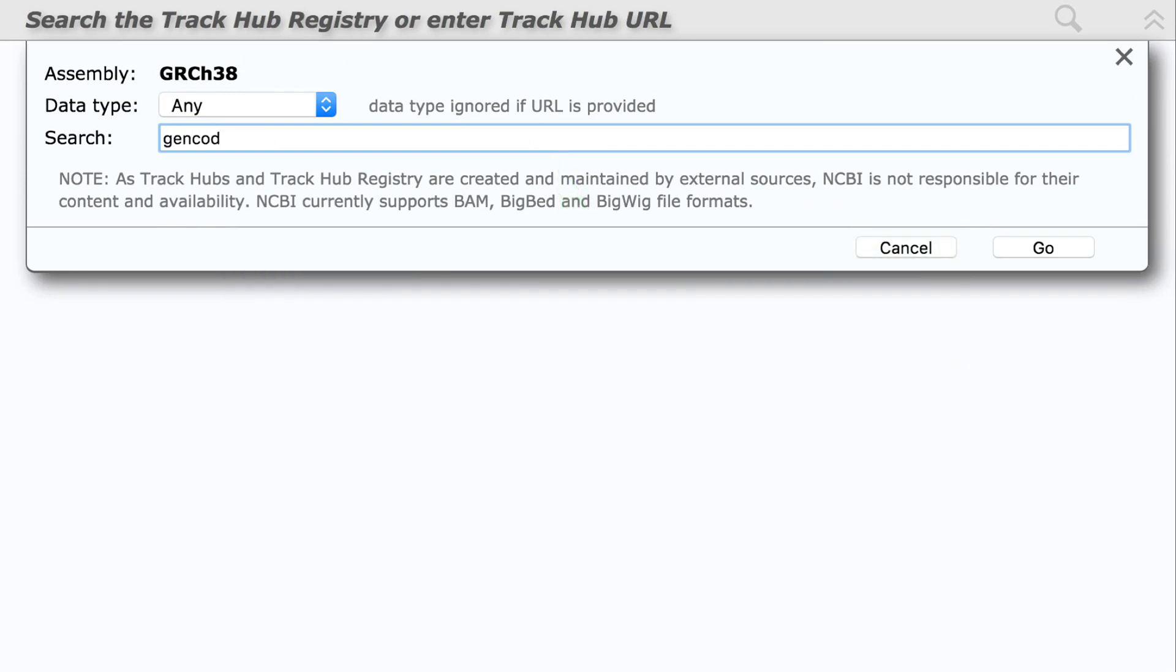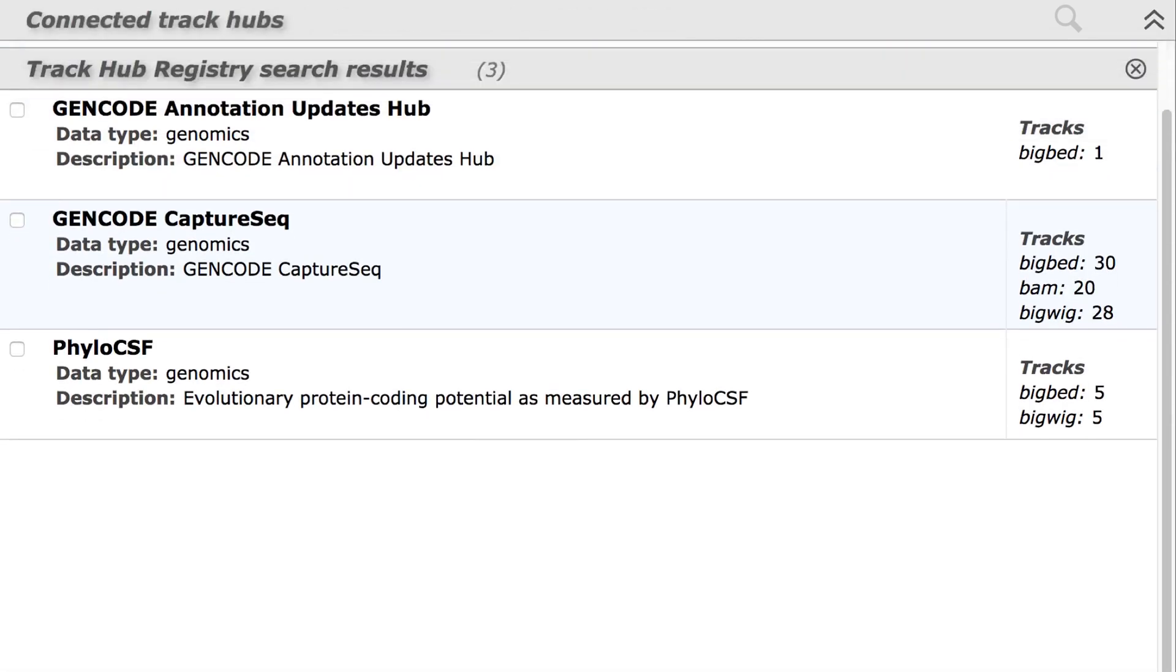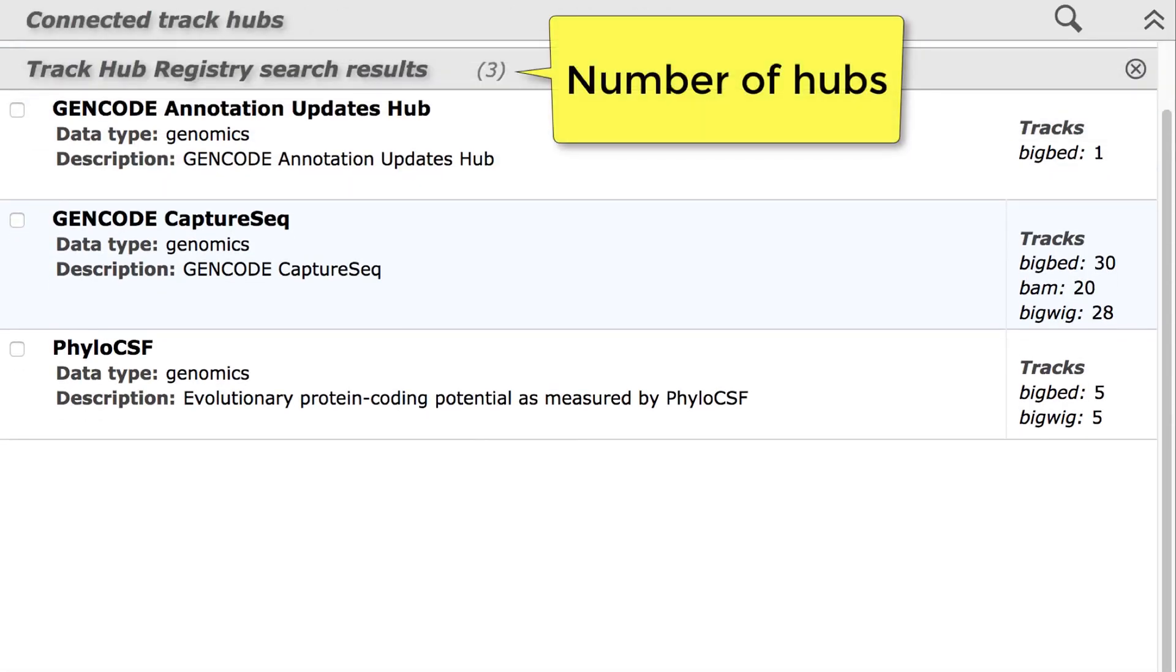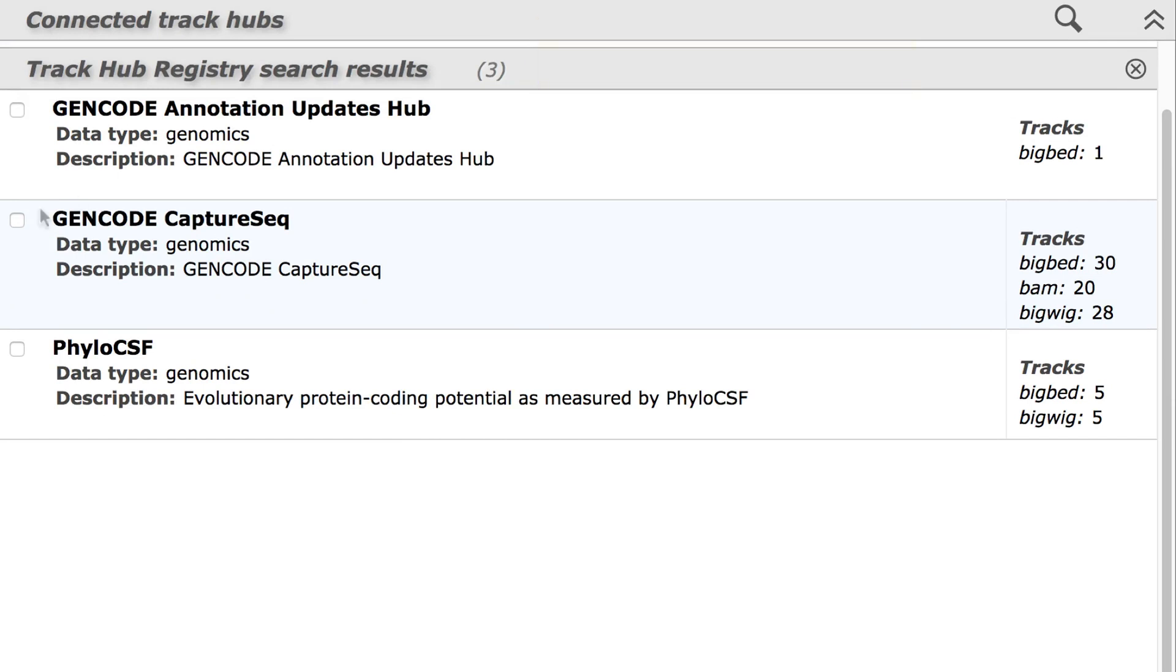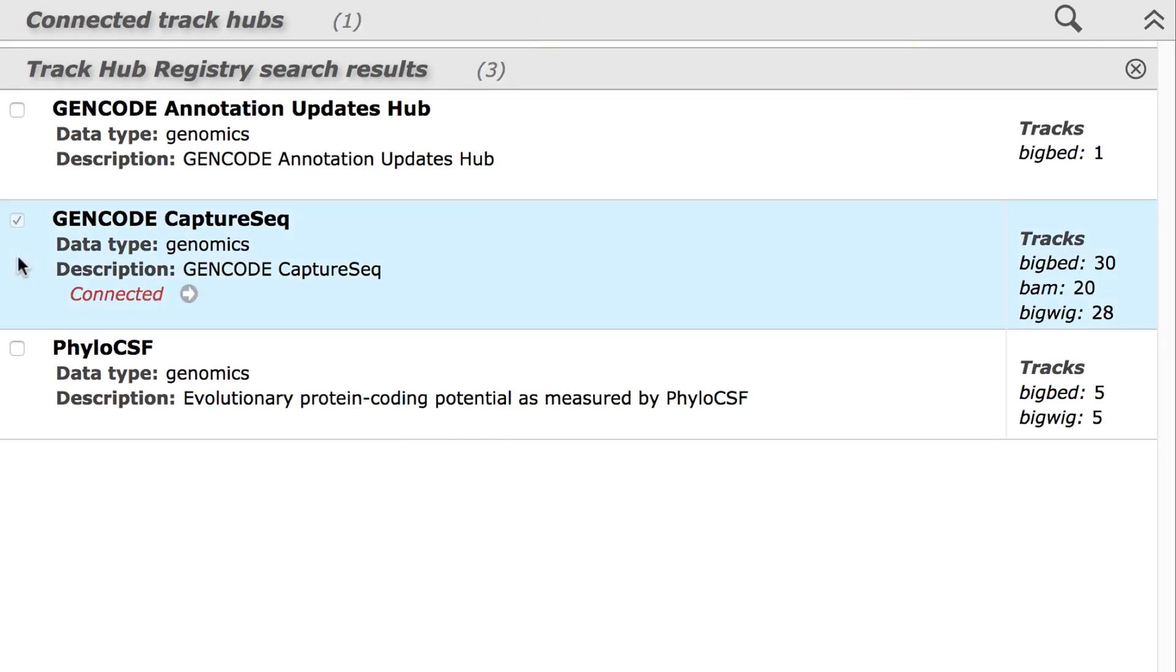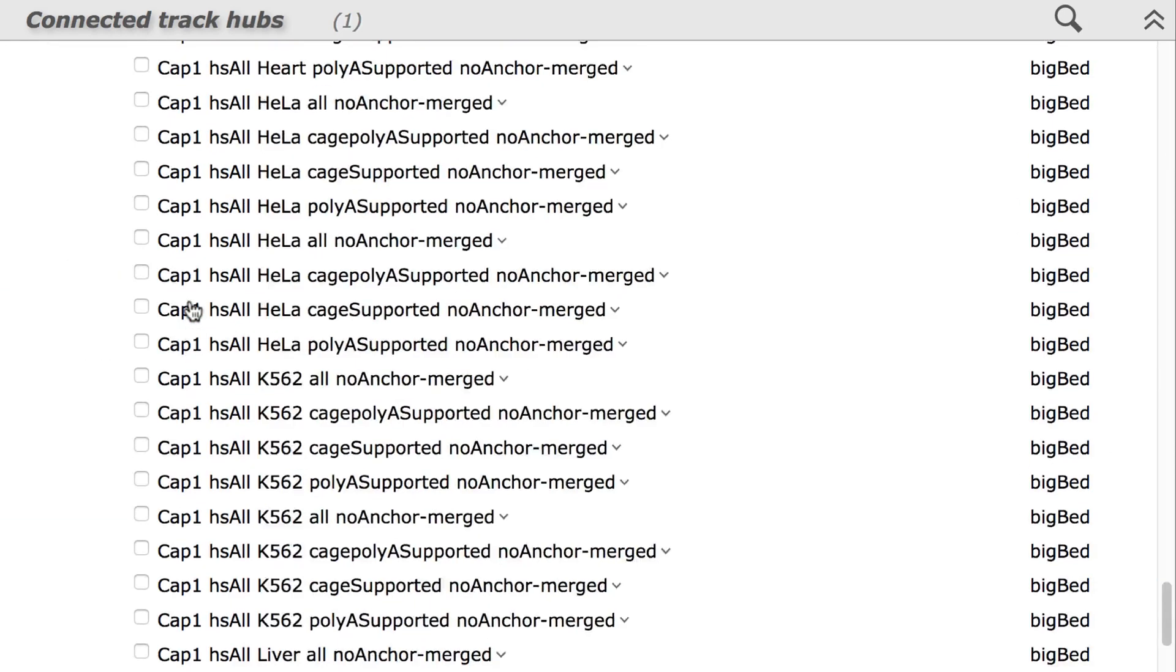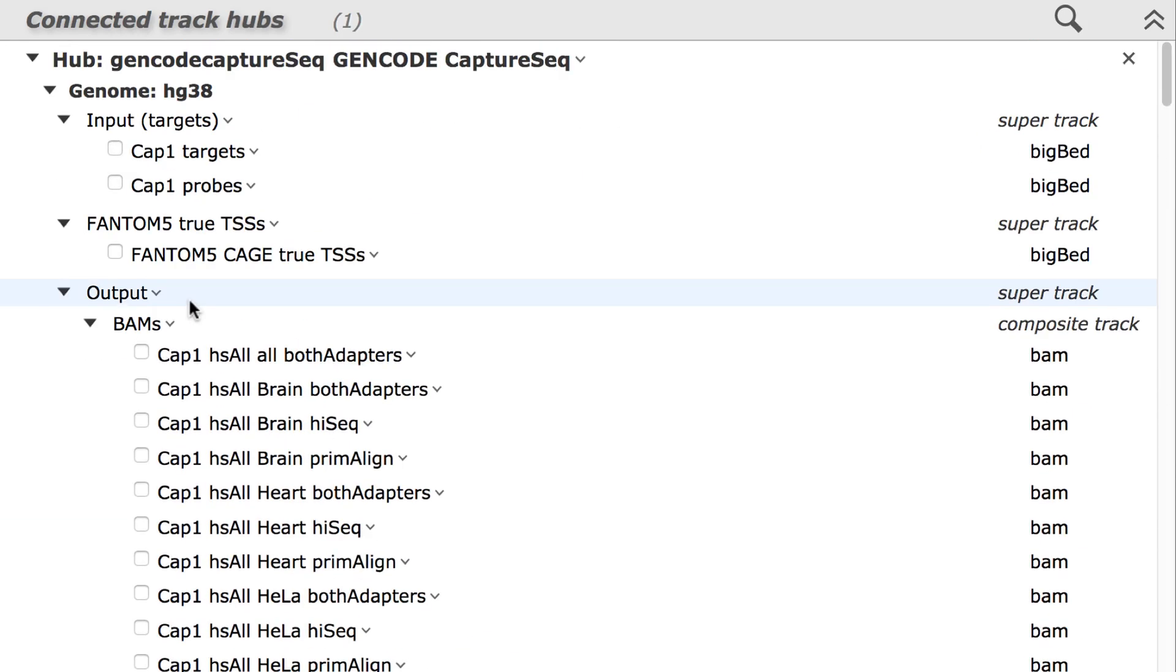I'll search for GenCode. You see the number of hubs in the results and the number of tracks per hub. Selecting a hub initiates the connection, and clicking the arrow expands the Track Selection menu for this hub.